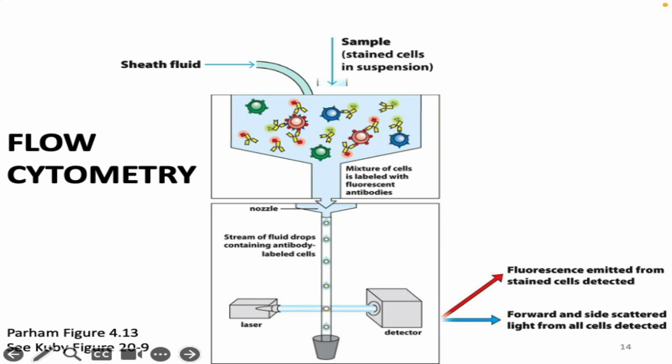What you might have done in preparing those cells is add antibodies of interest. So you took the spleen cells from your mouse and you said, I want to know about CD8 T cells in my mouse, so I'm going to add my anti-CD3 and my anti-CD8 antibodies. So I'm going to mix it all together. And you could see that if I did that, some cells would have no antibodies bound to them. Some cells might have one. Some cells might have multiple, all depending on different proteins that are on the surface of those cells.